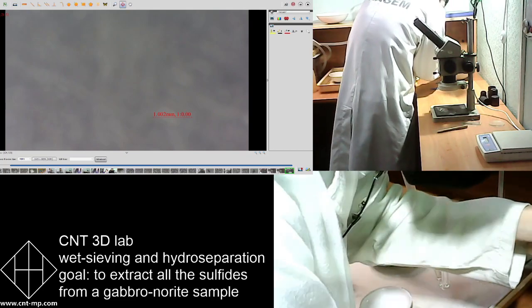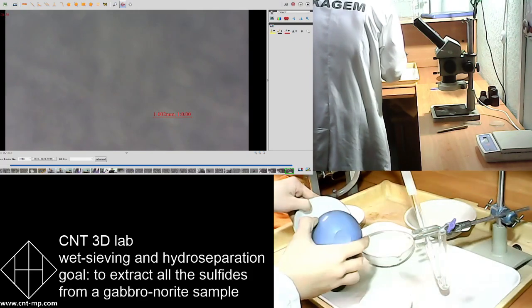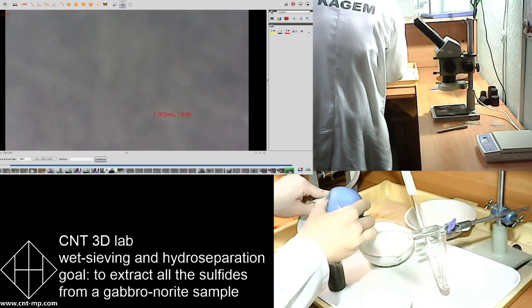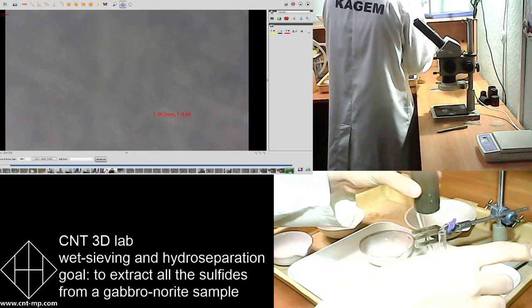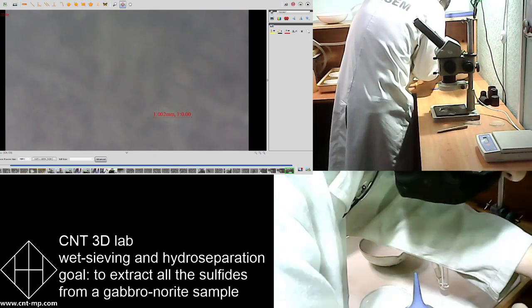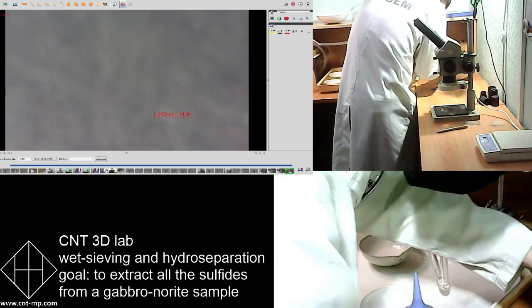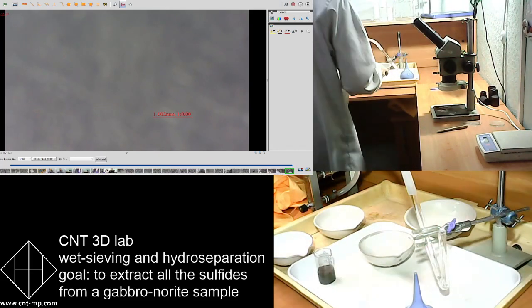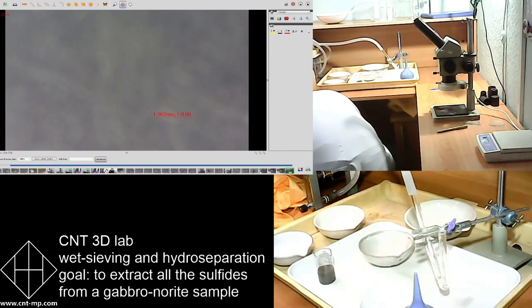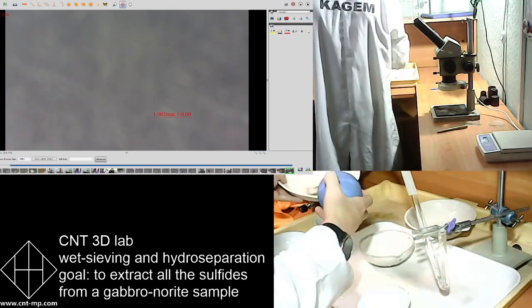You can see that any student can work with this technology, not like with EPD, though EPD Spark 10 is used, and it's very safe. So with hydroseparation, it's even less headache. It's just that you have to be very accurate. Do not spill particles on the table. Even though you spilled it in your tray, you can always reconcile it with the portion for HS.